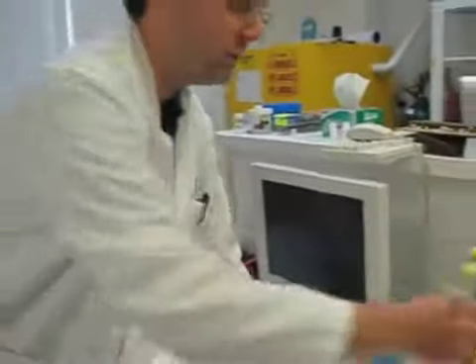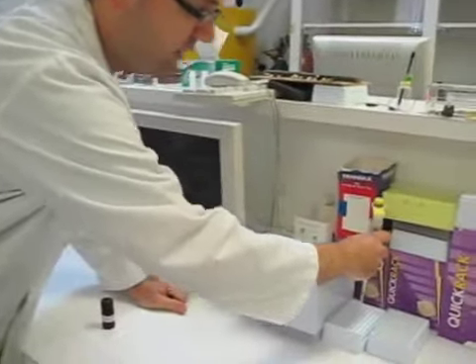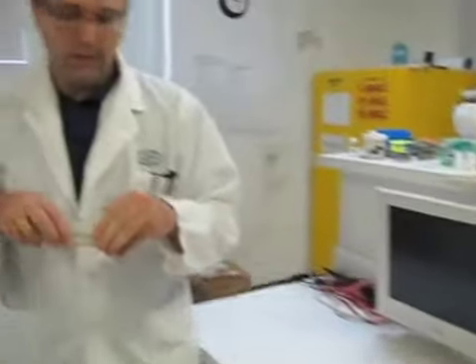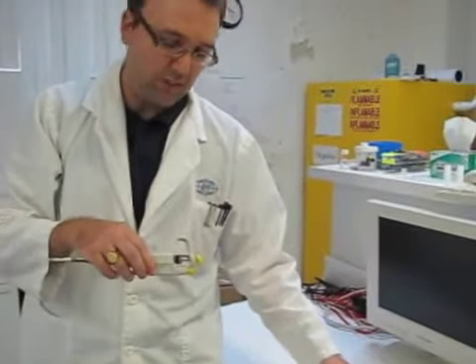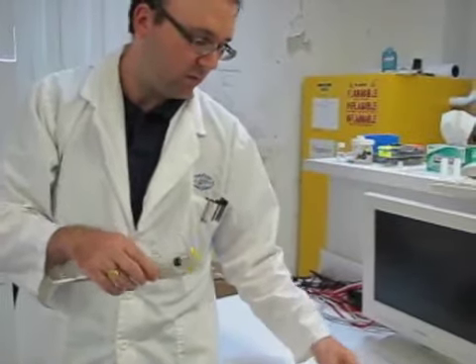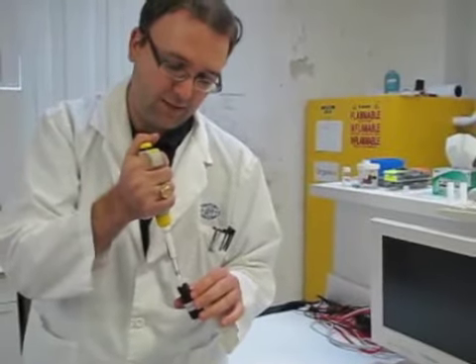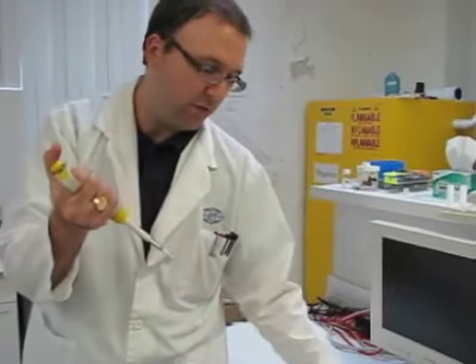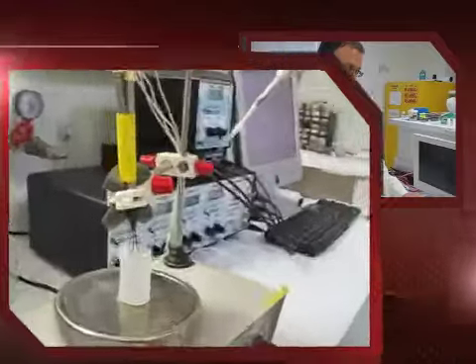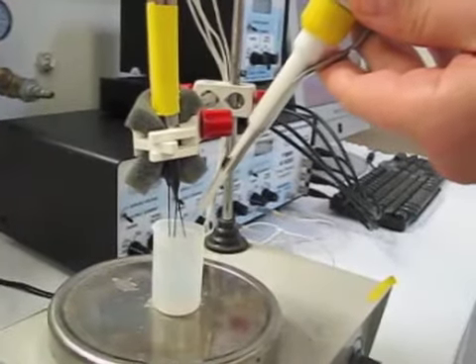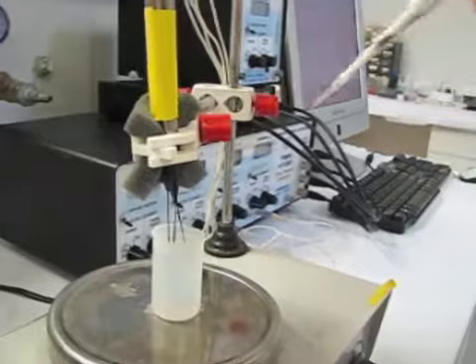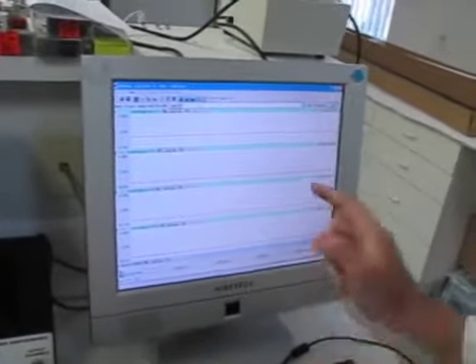Now, what we're going to do is start our calibration at 2 microliters. Since we're going to be using one millimolar hydrogen peroxide, a 2 microliter injection will give us a final concentration of 100 nanomolar. I'm going to try to make the same general area for my injections, because it's possible that you may see an injection spike on one of the sensors since we're testing more than one at a time.